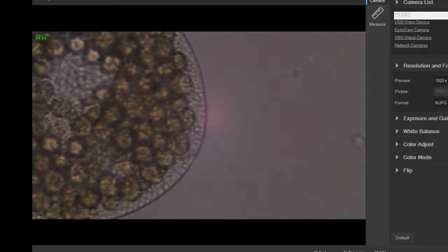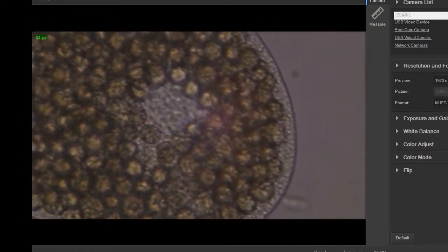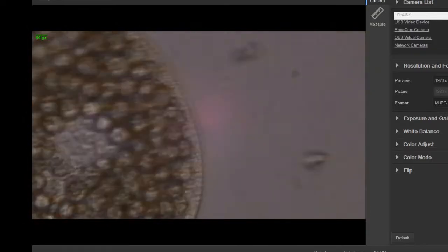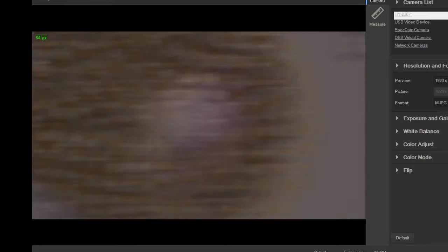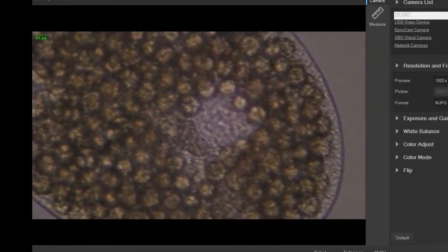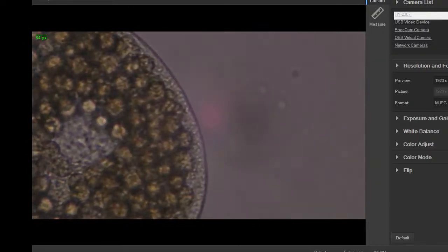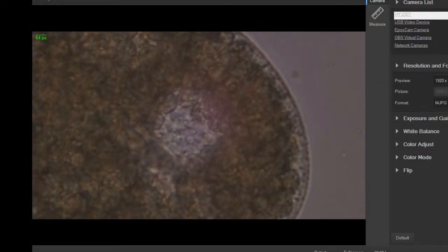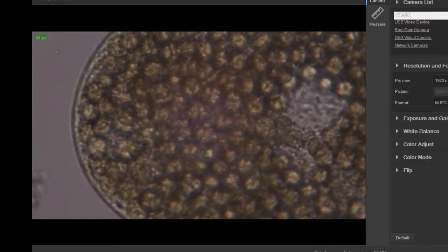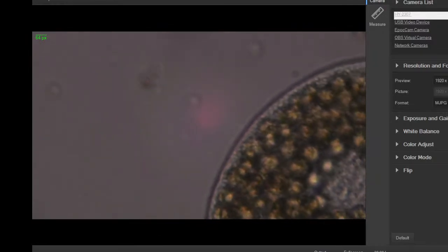But they're not like the thing I was talking about before, where they're gathered around in a sphere. Whatever you're seeing is contained inside of that single cell membrane, just like one of your cells. And you can see the cilia as I change focus. Little blurry lines moving around.